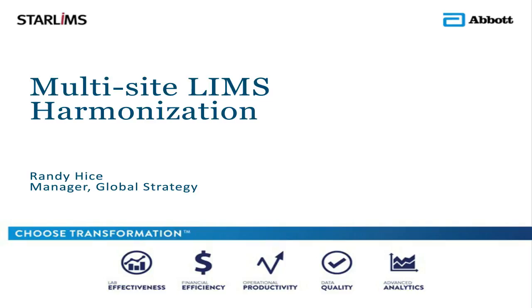Thank you, everyone. Thank you for attending. I thought by way of introduction, as Jack mentioned, looking back into the history of the harmonization process and the necessity for it. I did work for Digital Equipment Corporation. In the late 1980s, they decided to get away from an application technology. And suddenly, we had a lot of customers that were deployed on the LIMS SM platform that was hosted by Digital. We were suddenly faced with a lot of customers having to move to other vendor products. And we had to sit back and try to devise a strategy for the best way to understand the requirements and the ability to do that.